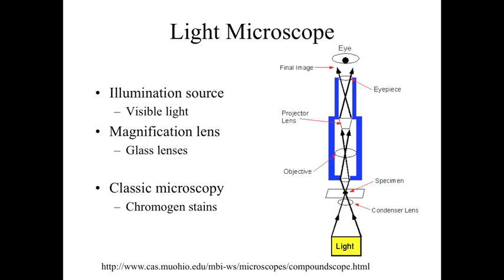Now, what we've talked about so far is that in order to be able to study the microscopic anatomy, in order to be able to study what's going on at the level of cells and molecules within the human body, we need to have magnification, and we talked about that in the first lecture. We need to be able to process the tissues so we can essentially magnify them. So we essentially use a microscope to be able to increase the apparent size of the image. And we need to be able to go through and add selective contrast so we can look at specific structures that we're interested in studying.